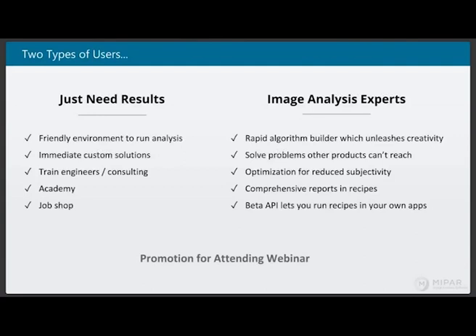Sure. There's a couple of good questions about stitched images and how MIPAR handles them. We have already worked with a lot of research groups that do these mass image stitches and try to do analysis on just absolutely massive image data sets. We take it from case to case. We have successfully solved those problems. We can't say exactly whether it's going to work for you without you reaching out to us and us taking a look at the problem. So feel free to contact us and we'll be happy to work with you.